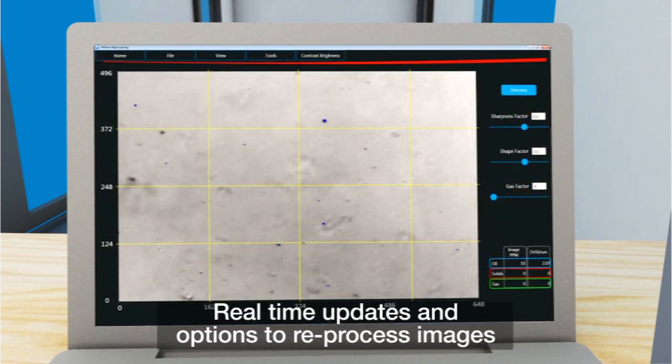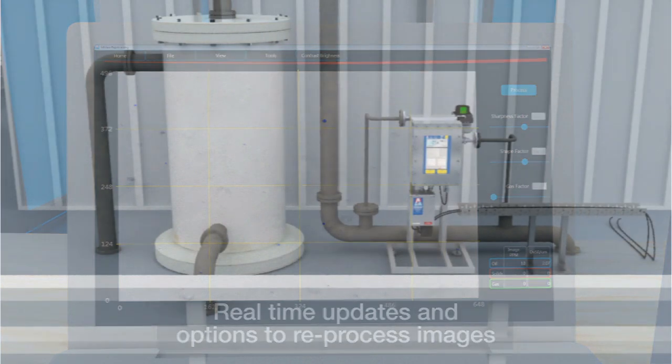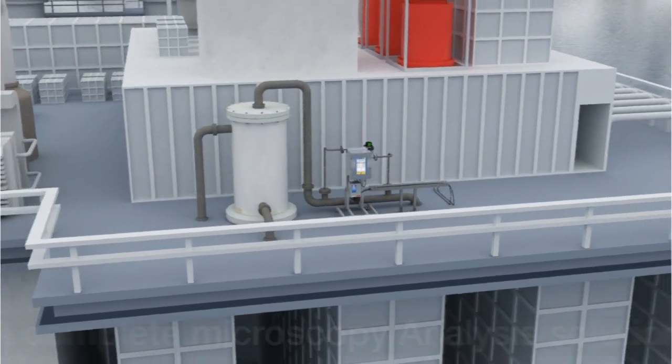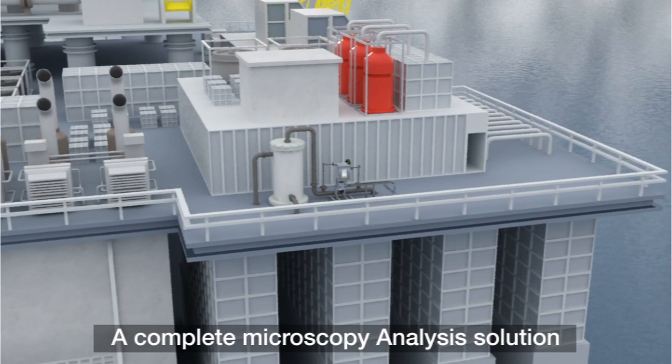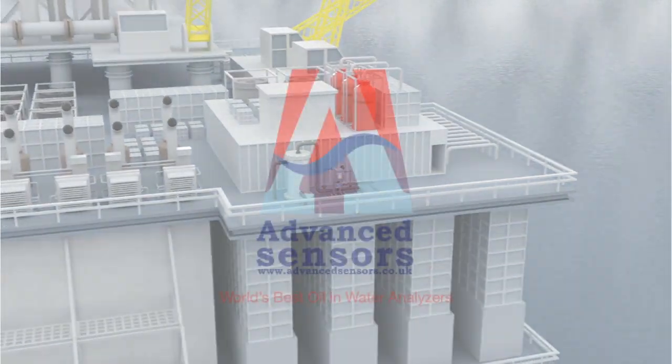Advanced Sensors have developed proprietary remote software. This unique feature continues Advanced Sensors' goal of meeting customers' demands today and future needs tomorrow.